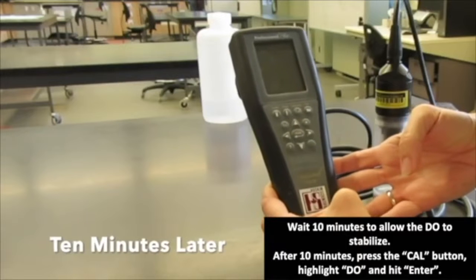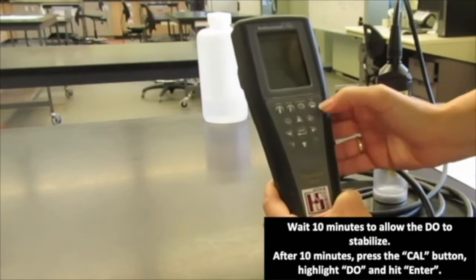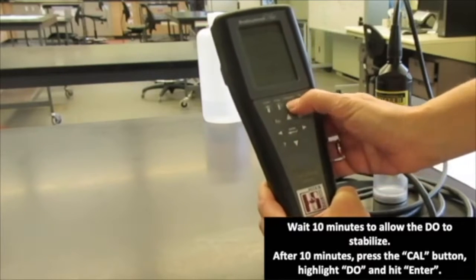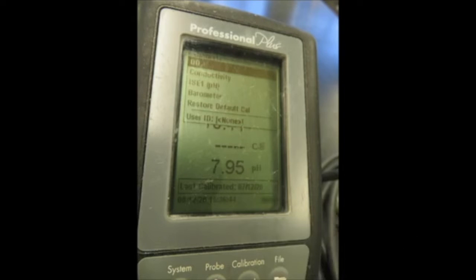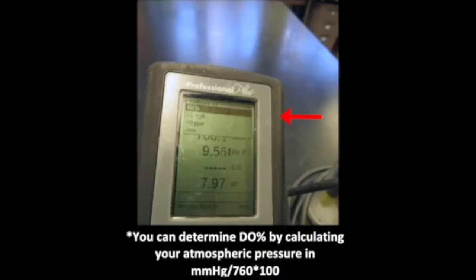After 10 minutes has passed, we are going to calibrate the DO probe. We hit the Cal button, which stands for calibration. We highlight DO in the window and hit enter. It provides a few options — DO percentage, DO milligrams per liter — and we want DO percentage, so we hit enter again on the meter.